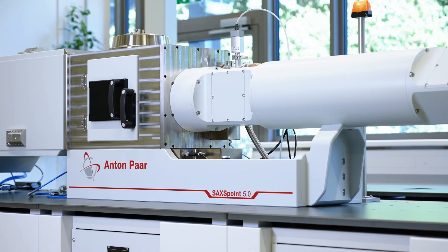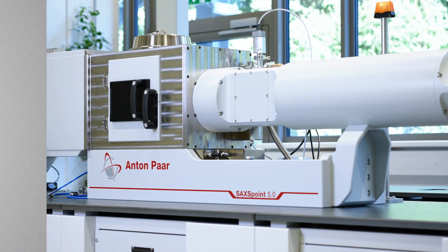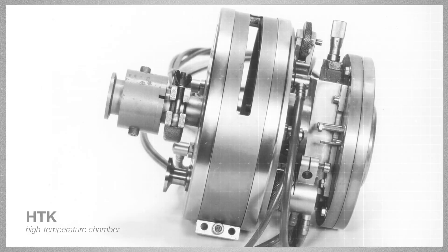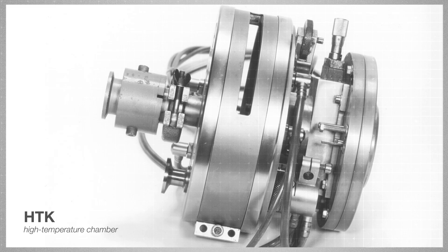When something is in your DNA, it drives ambition. For more than half a century, we've set the tone in small-angle X-ray scattering and non-ambient X-ray diffraction.